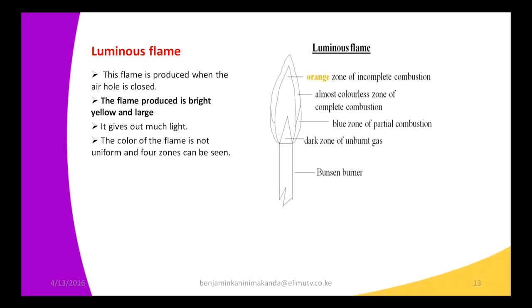All the carbon and hydrogen within the gases are burning because of the full, large supply of oxygen gas. Therefore, complete combustion is taking place at this zone, and the zone becomes colorless.